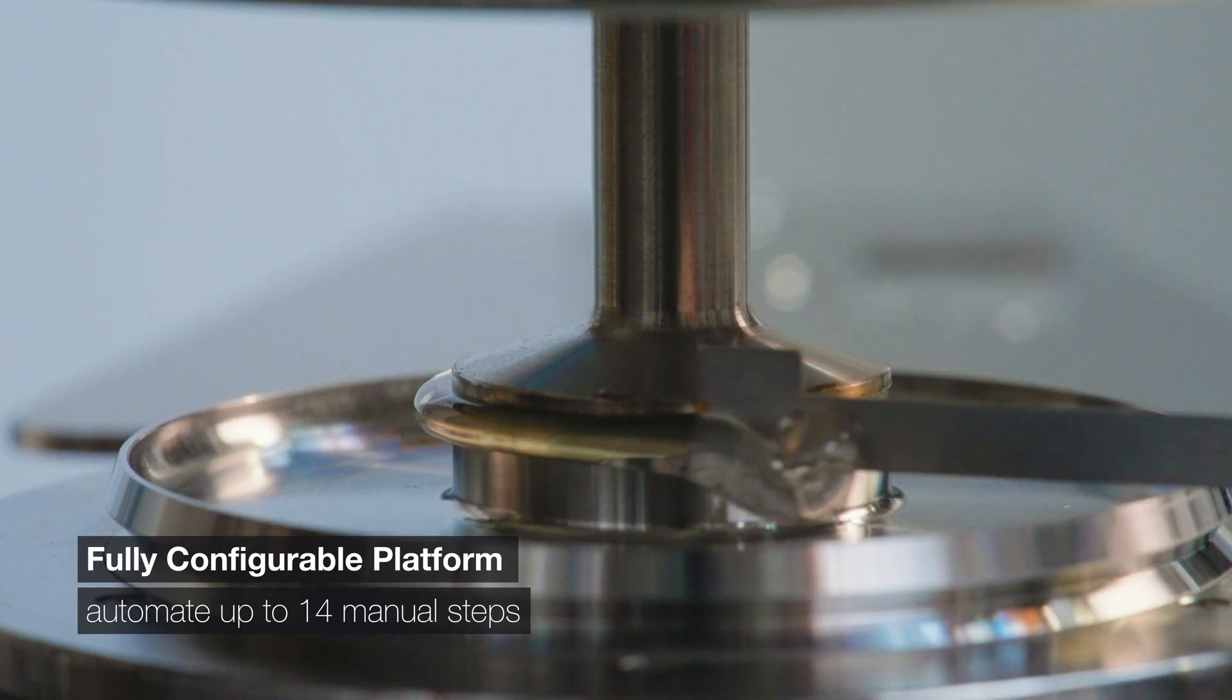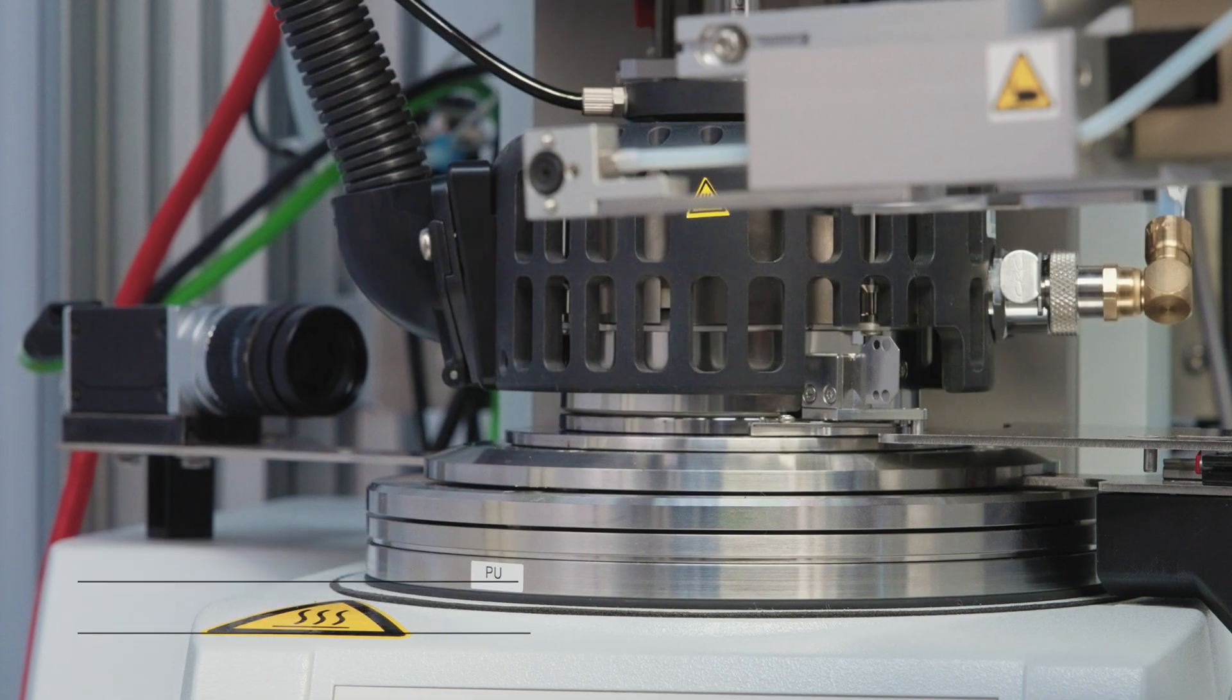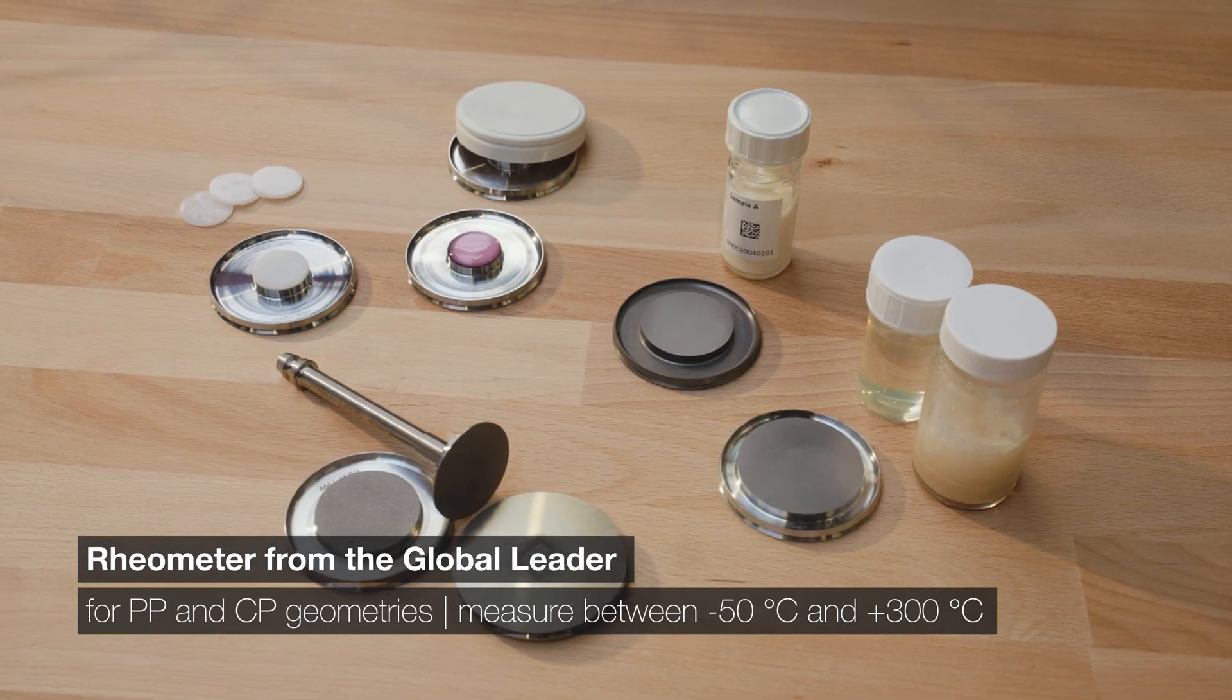Accelerate innovation and productivity. Optimize the value stream of your lab by minimizing process waste and freeing up time for your experts.